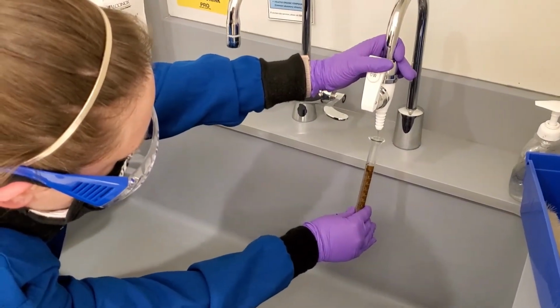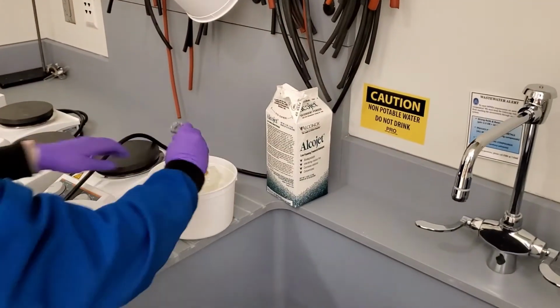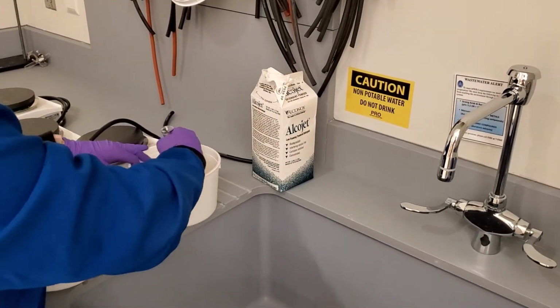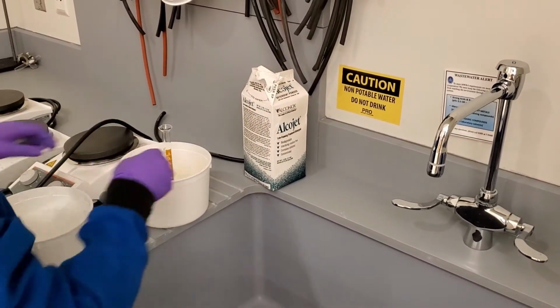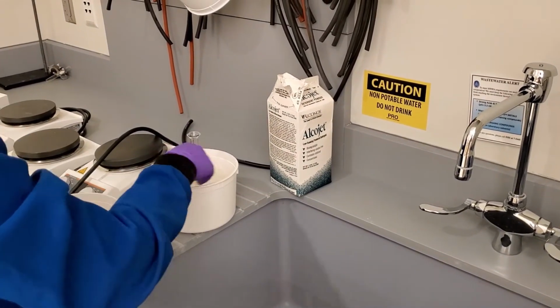Next, fill the graduated cylinder with 4 milliliters of deionized water. Place the graduated cylinder in the ice bath to cool. Add more ice and water to the ice bath until it covers the level of the water in the cylinder.